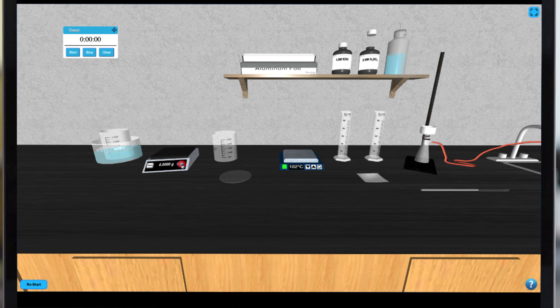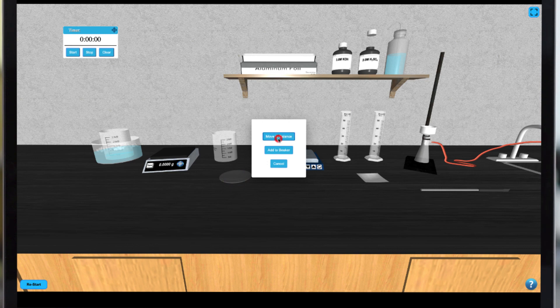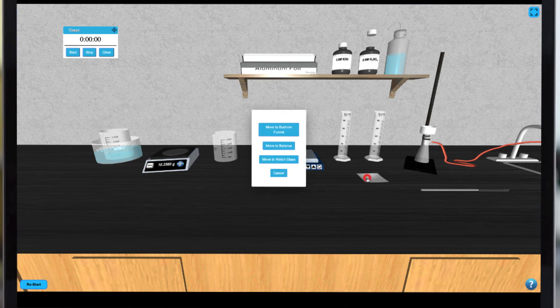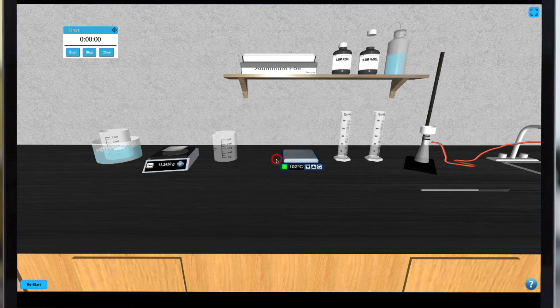After cooling is complete you can turn on your balance to obtain the mass of a watch glass and a new piece of filter paper. After noting that mass you can place the filter paper on the Buckner funnel by clicking on it.